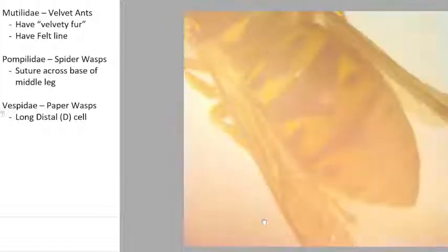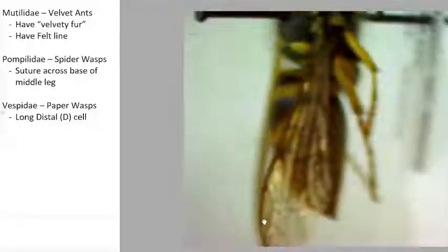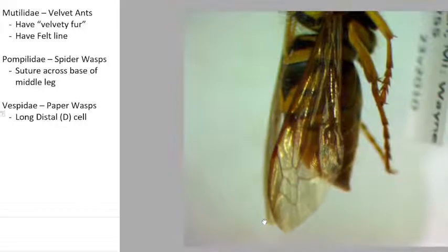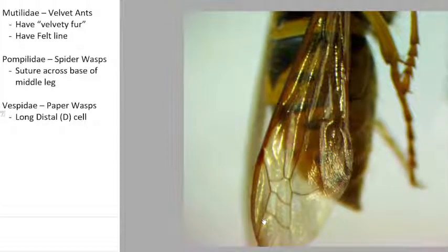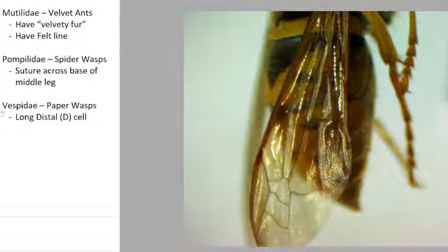Because the wings on this guy are a little folded up, and it makes it a little bit more difficult to see. Maybe we can go the other wing. Oh, that's better. Okay. Now, looking at the wing of a paper wasp, we want to be looking at this really, really long cell right here. This is the D cell, or the distal cell. So this is the D cell right here.